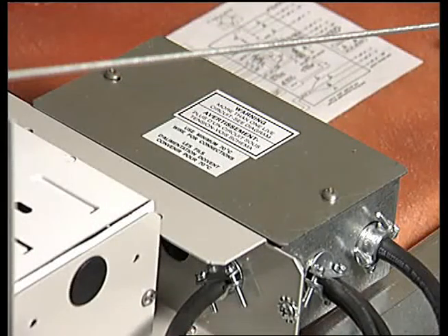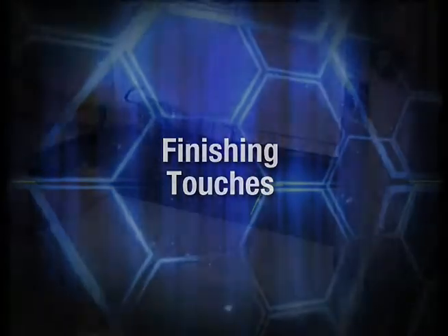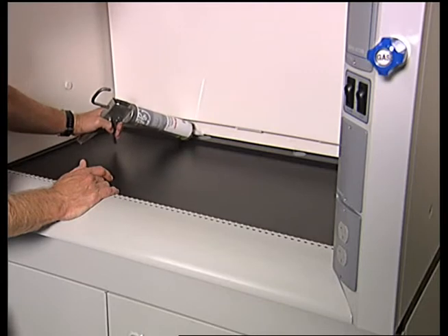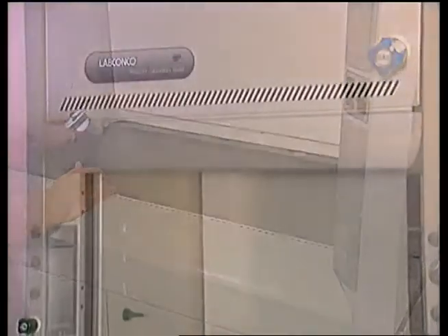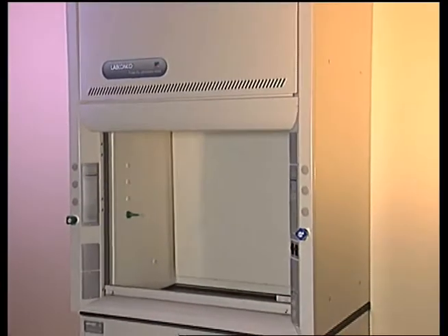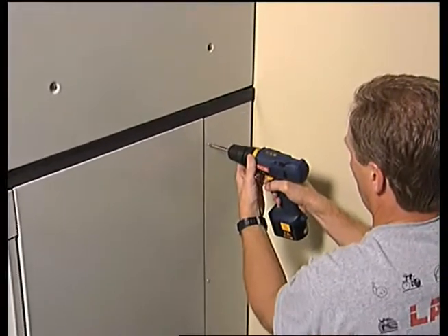An electrician should wire the hood according to local codes. The fume hood should be sealed where it meets the work surface to prevent spilled materials from collecting between them. Seal the hood by applying a bead of RTV sealant between the hood and the work surface. Once all electrical and plumbing connections are made, replace the side panels with the fill-up screws. Attach the filler panel to the panel angle with the hardware provided.